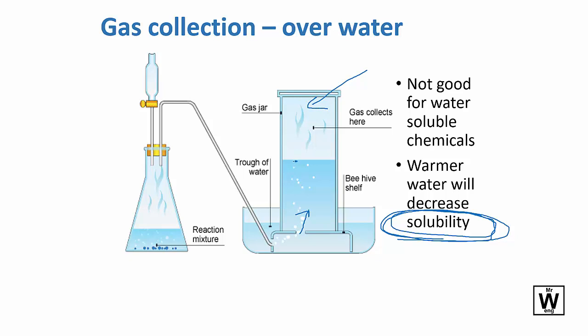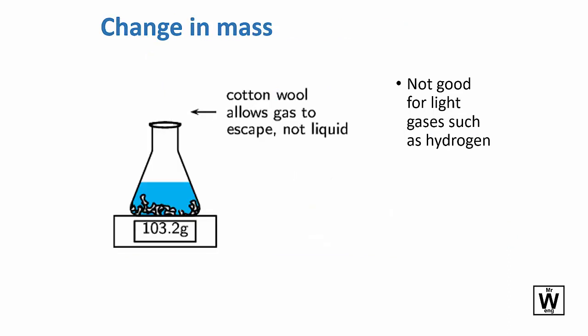So the water itself, water vapor, is actually coming off as well and adding to the total gas volume in here, and you need to do a partial pressure equation for that. You also need to worry about the warmth of the liquid itself reacting, and you can even get steam coming in here, so there can be all sorts of issues going on with these sorts of things.